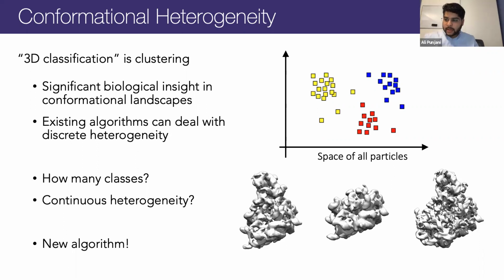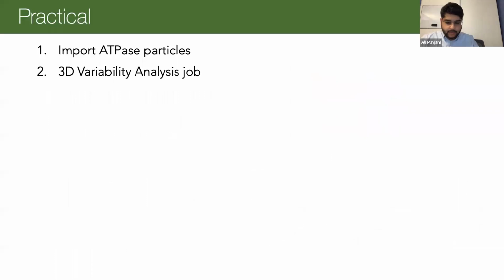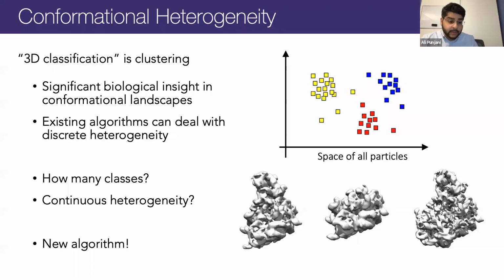It's a dream and a goal for single particle EM as a field to be able to look at and investigate from an experimental perspective protein dynamics. And it's totally conceptually possible, computationally very difficult, and algorithmically very difficult. And 3D variability analysis is a step forward in that direction.